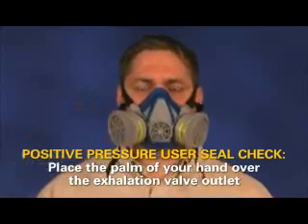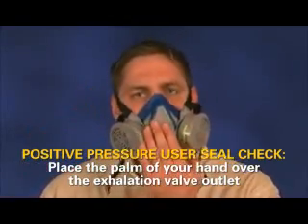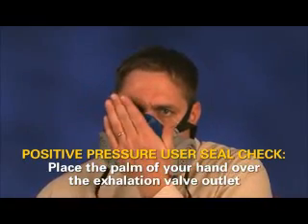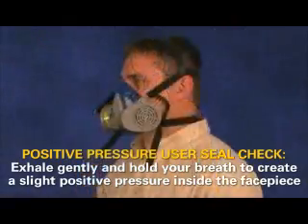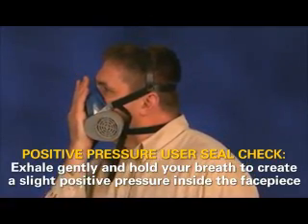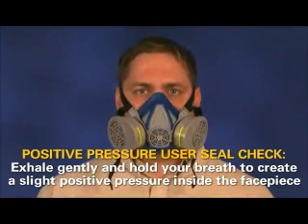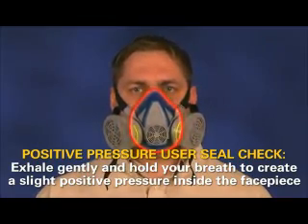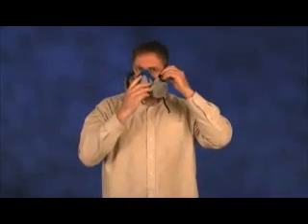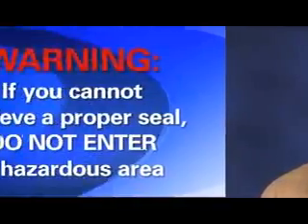Next, perform a positive pressure user seal check. Place the palm of your hand over the exhalation valve outlet. Do not push so hard that you distort the natural shape of the facepiece. Exhale gently and hold your breath to create and maintain a slight positive pressure inside the facepiece. If the facepiece bulges slightly and no air leaks are detected between your face and the facepiece, a proper fit has been achieved. If, on the other hand, you detect a face seal leakage, reposition the facepiece and readjust the straps, and then retest. If you cannot achieve a proper seal, you are not protected and should not enter a hazardous area. See your supervisor to determine what the problem may be.